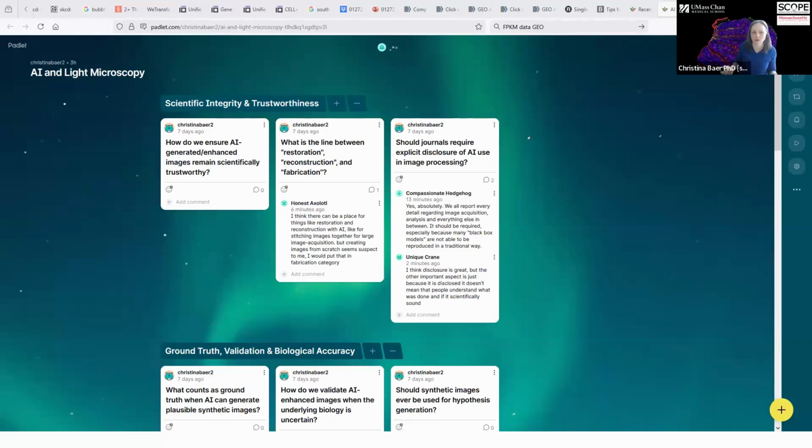None of us are typically handling patient data on our microscopes, right? And so that's not the level of concern that's more common, at least in my facility. It's more a question of what discoveries are we making on the systems that could potentially be disclosed, either with or without our knowledge, before we're ready to publish them or before we fully capture the potential impact of those data in terms of IP licensing and all of those issues for sure.